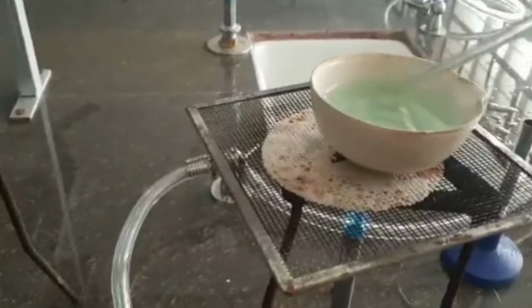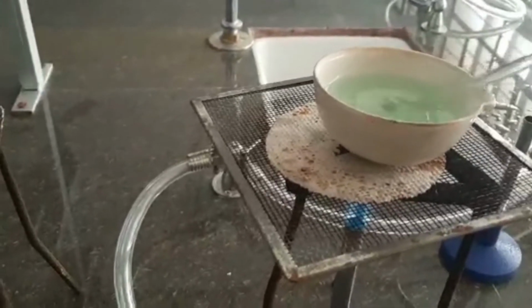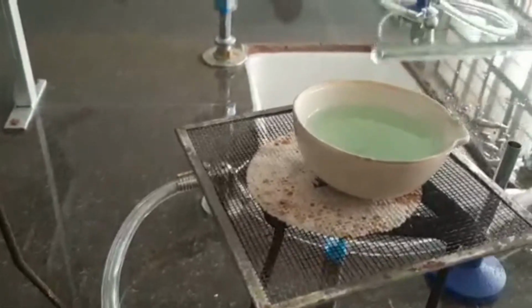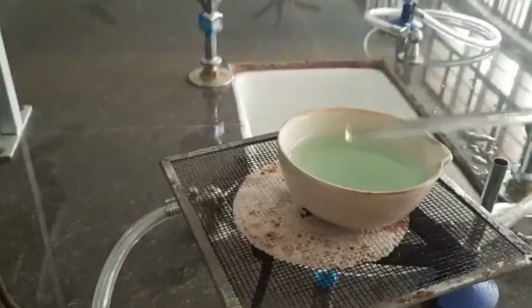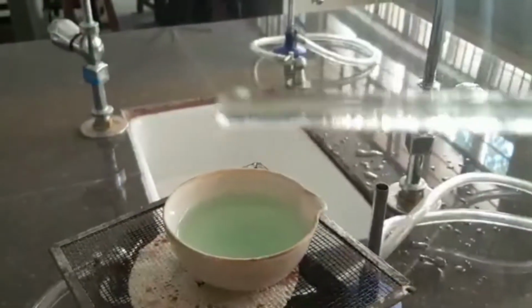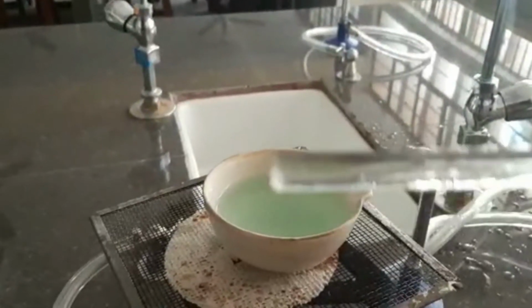Now how long are we to heat it? We have to check the crystallization point. So to check crystallization point, from time to time we will take this rod dipped in the solution, just cool the rod by blowing over it and look for any crystal formation. Right now you can see the rod is clear. So after some time we will check again.